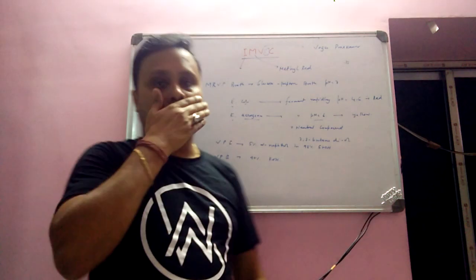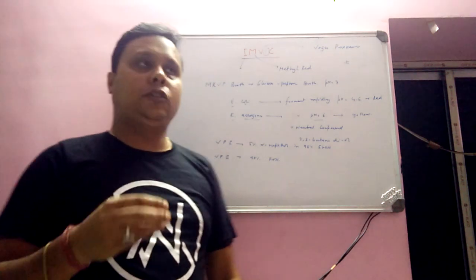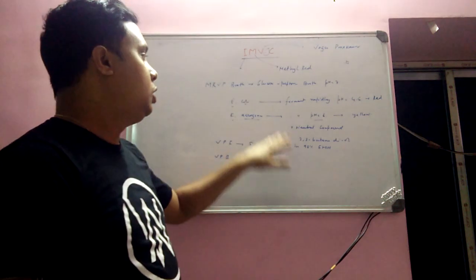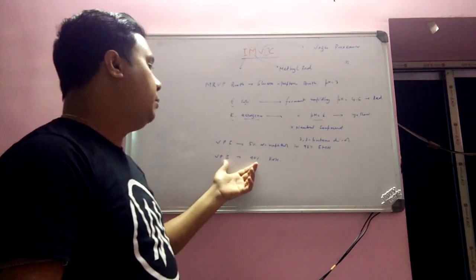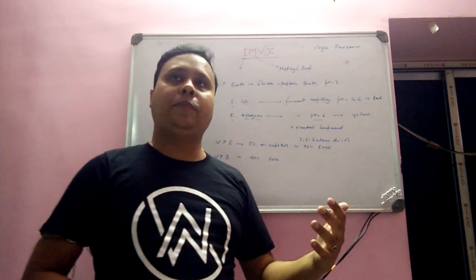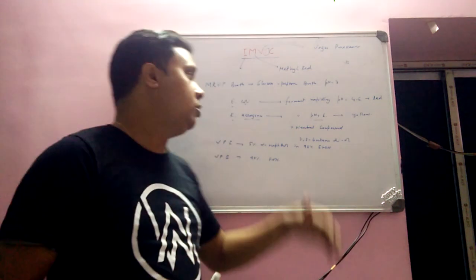In order to do the VP test, add 0.5 ml, or 8 to 10 drops, of VP1 reagent to a test tube, then shake the media, then once again add VP2 reagent, 0.5 ml or 8 to 10 drops, into the same test tube.